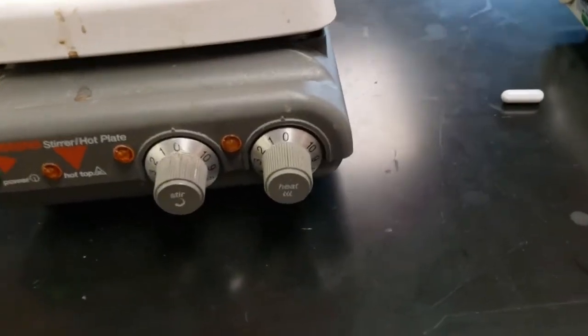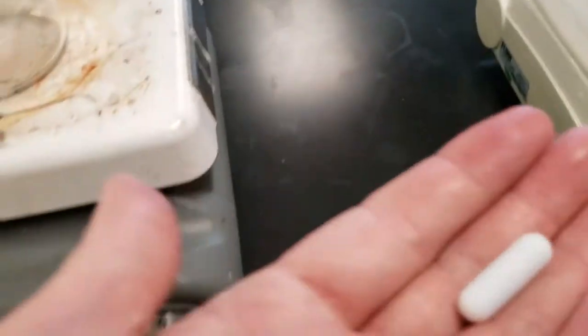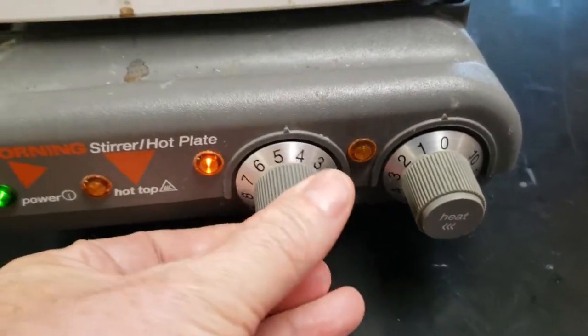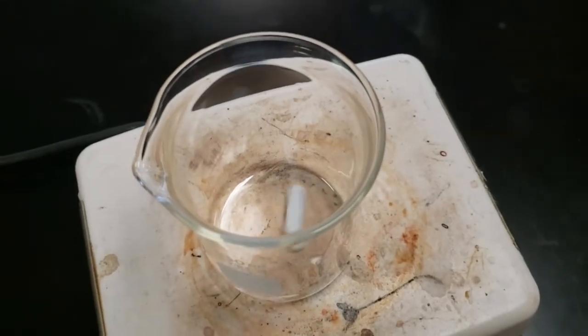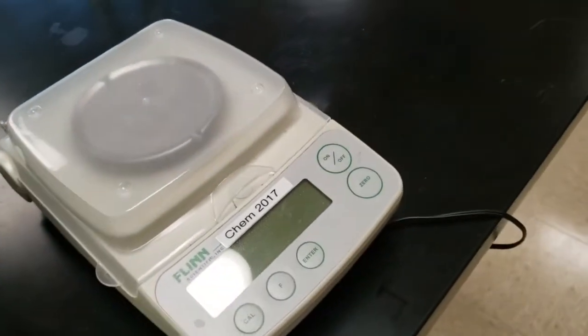This is a Corning hot plate. It's also a stir plate. If you want to heat it, you turn the heat on. If you want to stir, you turn the stir on. You have a little metal bar that's coated in plastic. Inside, there's a motor, and when you turn it on, it magically spins. It's good for stirring up mixtures when you're trying to dissolve things.